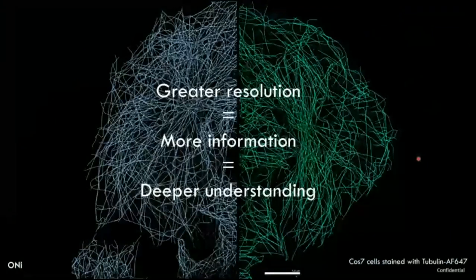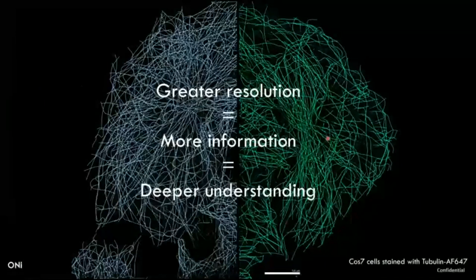So I hope today that I've demonstrated to you that greater resolution provides more information, which ultimately leads to better understanding of biological processes.